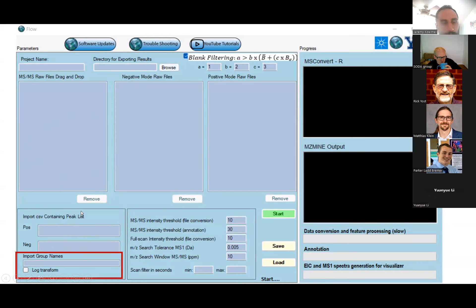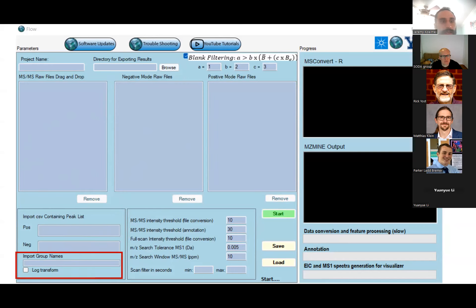We also enable statistics — violin plots, volcano plots, things of that nature. You can import group names, and as long as your files have those group names in them, you can automatically assign groups and do the stats.